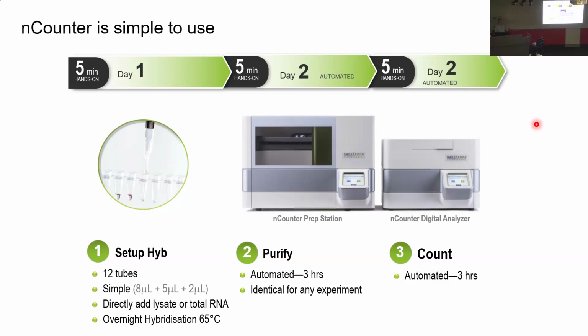You can open it, you can pause it if somebody's already in there counting, open it, add yours, tell it to run it in a queue, close it, because it can run up to 6 of those experiments in there by being interrupted and running. So that can run 24 hours a day. And again, that typically takes about 3 hours. So by the end of that next day, you're going to have a digital data set.